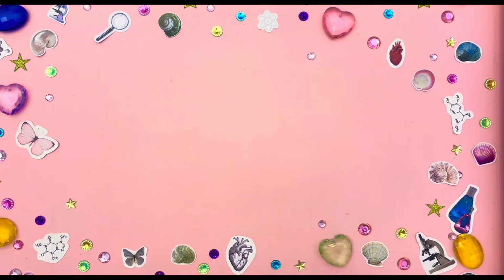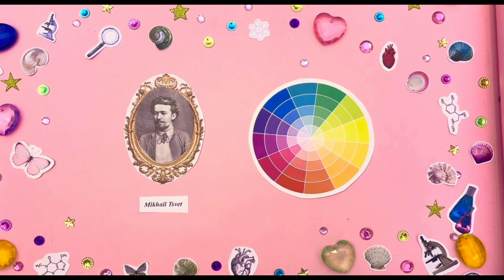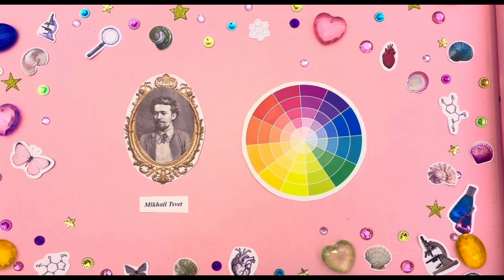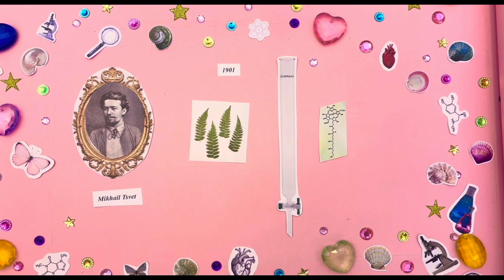This technique of column chromatography, meaning to show with color, was first developed by a Russian botanist named Mikhail Tsvet, whose last name ironically also means color. In 1901, Tsvet wanted to separate plant pigments, so he packed a column with calcium carbonate as a stationary phase, poured his plant extract at the top, then eluted its components with an organic mobile phase. The plant pigments separated into distinct colored bands, including chlorophyll and his newly discovered carotenoid pigment.